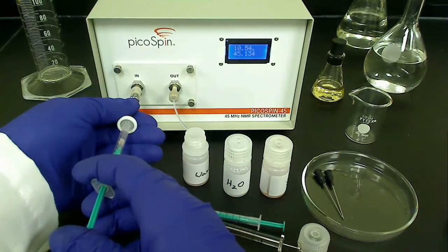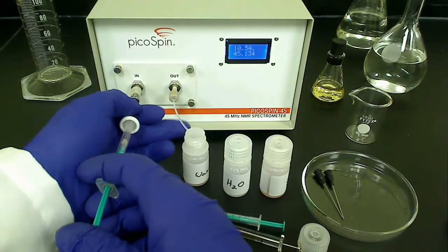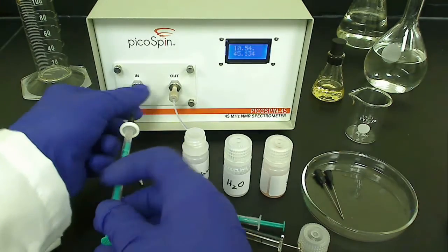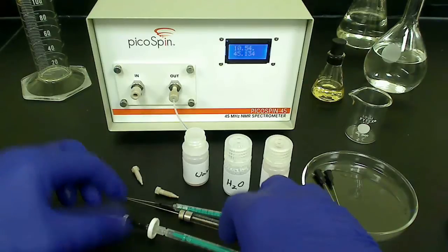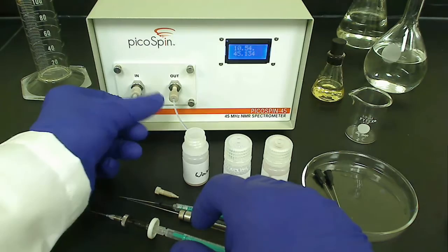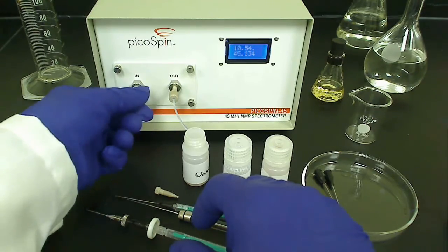Draw up a sample like before, but include a little more volume, approximately 0.3 to 0.4 milliliters, to account for the additional dead volume introduced by the syringe filter. Attach the syringe just as before, inject the sample, cap the inlet, and perform the experiment.